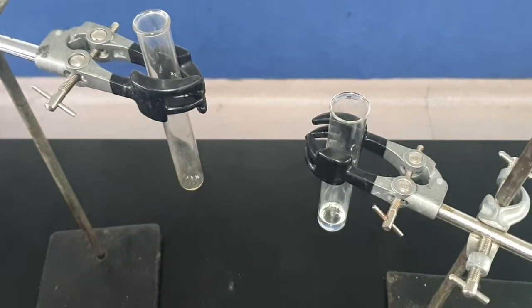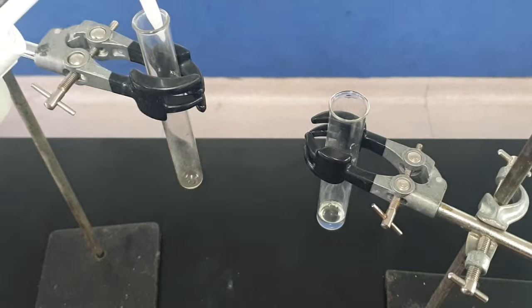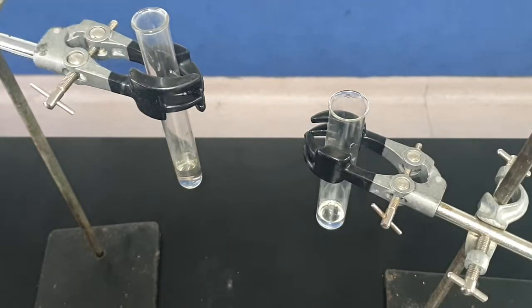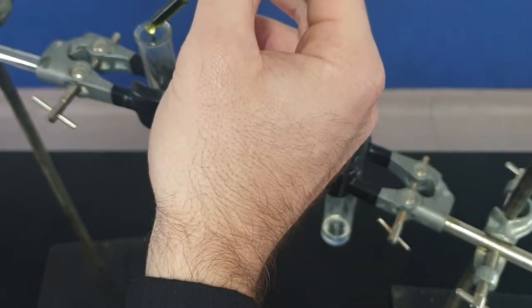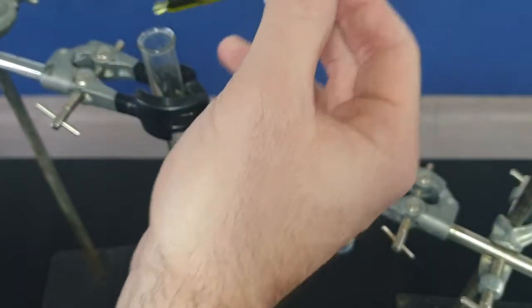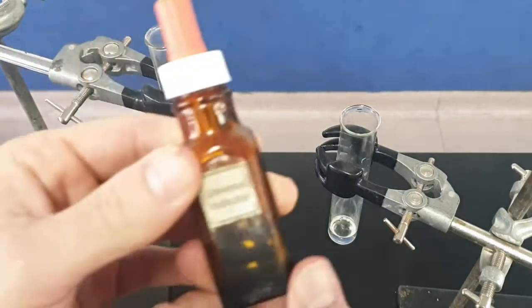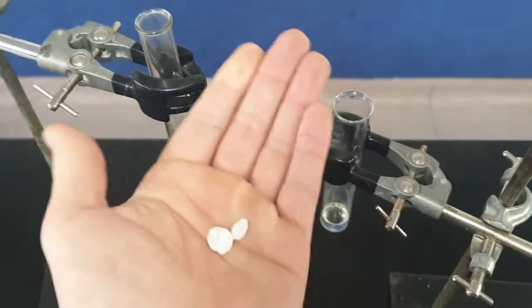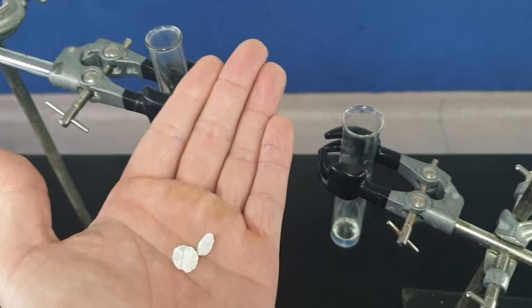Now with your test tube filled with acid, we're going to fill the next test tube with water. And in the water, we're going to put universal indicator. The carbonate that we're going to be using is calcium carbonate, and you can just use marble chips.